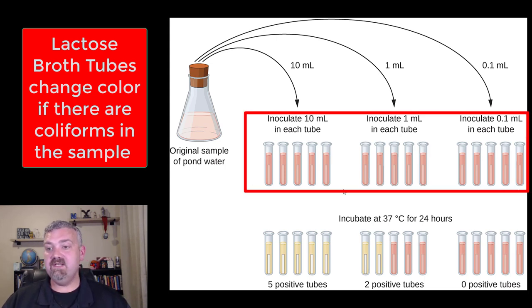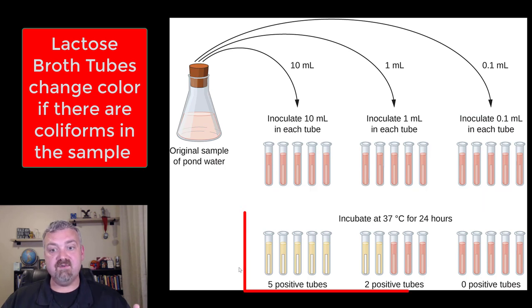You see on top you've got the 15 tubes that are reddish—those will be your lactose broth tubes. And then on the bottom after incubation you see that some of them are turning yellow. That means there are microbes there that are digesting the lactose, causing a pH change, and that's why you see the color change.